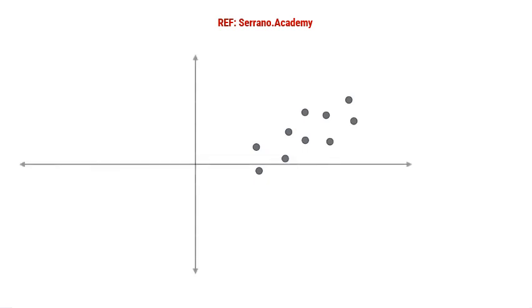Well, first let's put it in some coordinate axis. And the first thing we're going to do is center it. So center it means we're going to take the average of the coordinates, both in the x and in the y direction. Find that center of mass. Think of the point where this set would balance and move that to 0. So we're going to move it so that this data set is centered at 0.